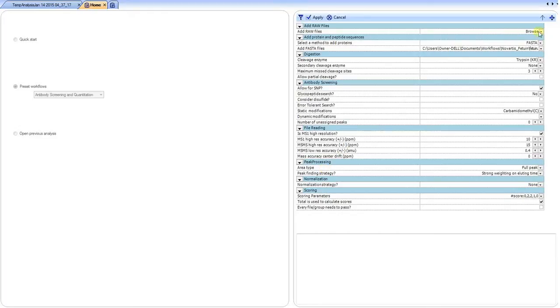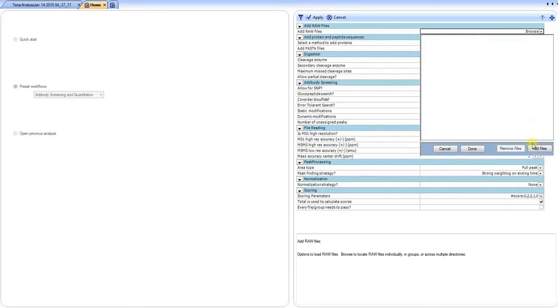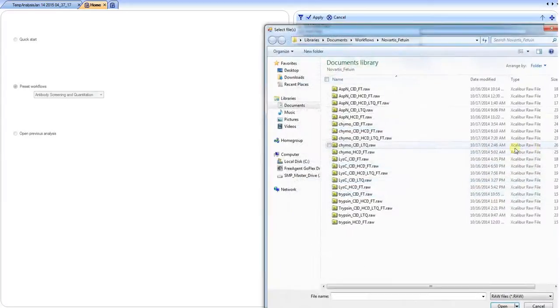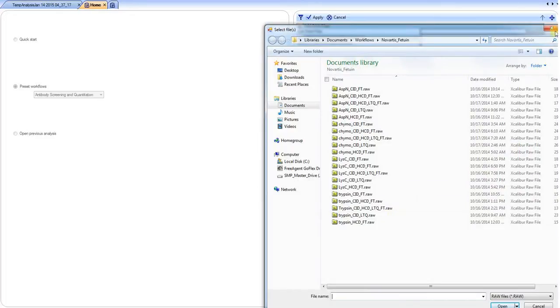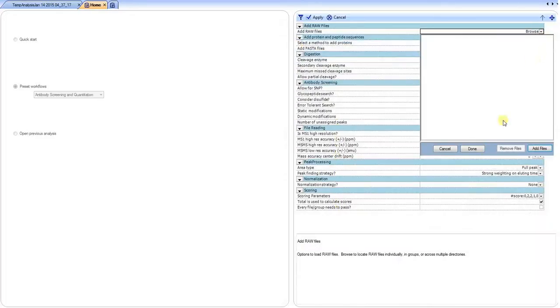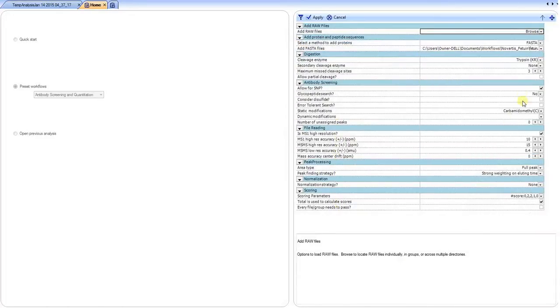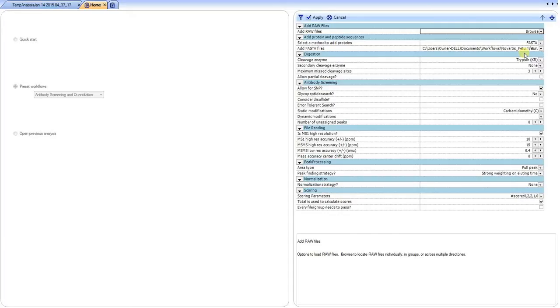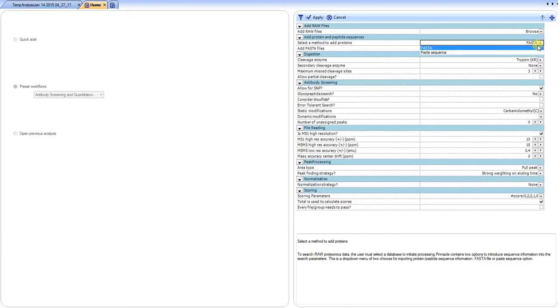The first thing is to select your raw file, and you can simply grab your specific raw file. Next, you would grab your database, which is in the form of a sequence for the protein. This can be added in from a FASTA file, or you can just copy and paste the sequence.